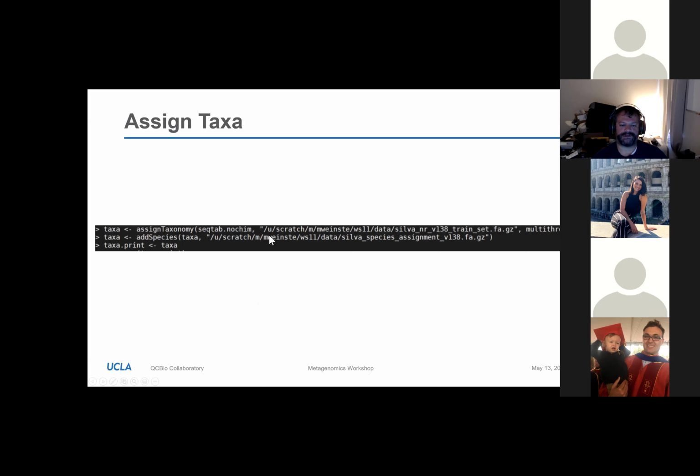I think these are publicly readable. Ideally, you want to use your own copy just because it might get slow if everybody's trying to read off of mine. That's going to probably jam up the hard drive. But if you don't change this, it probably will still work.